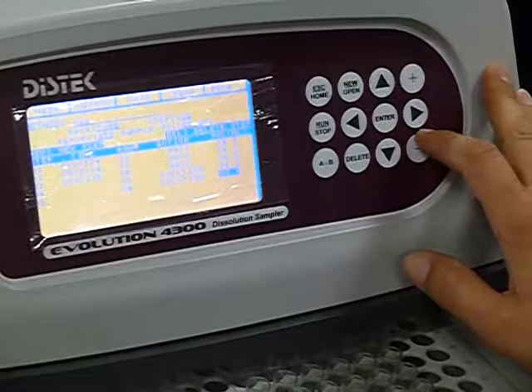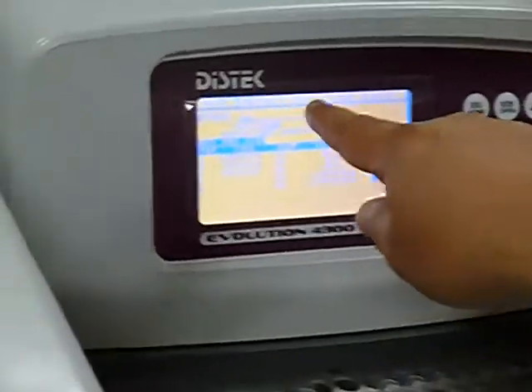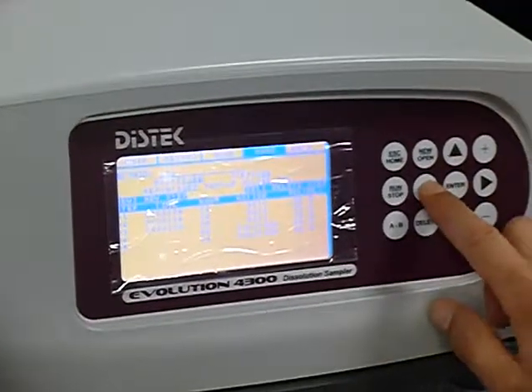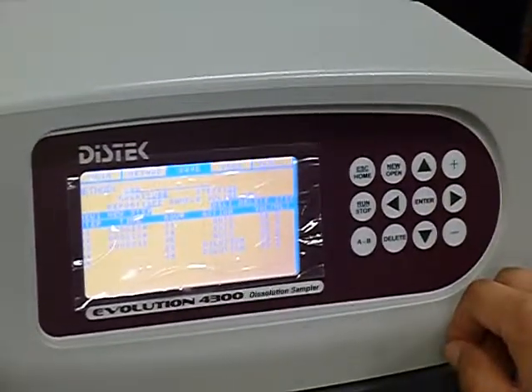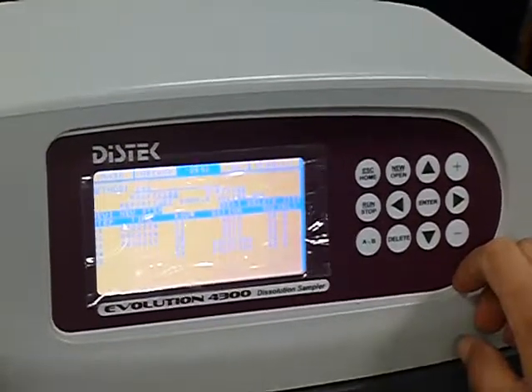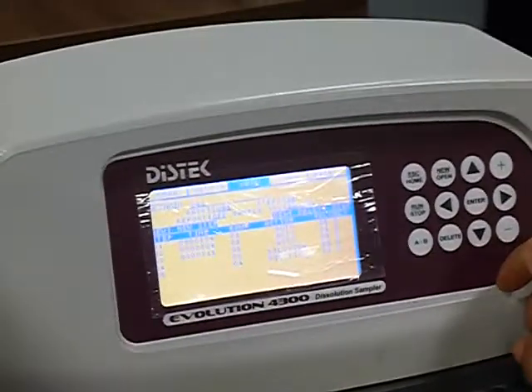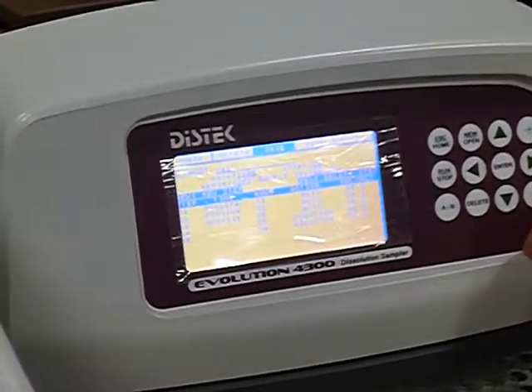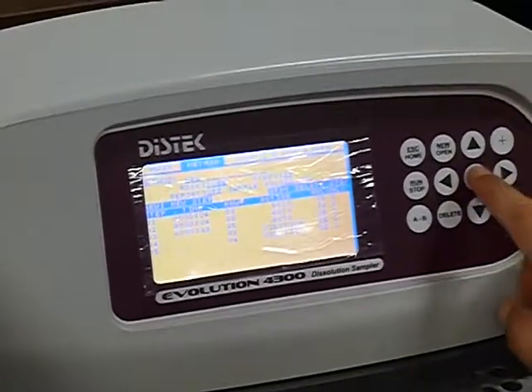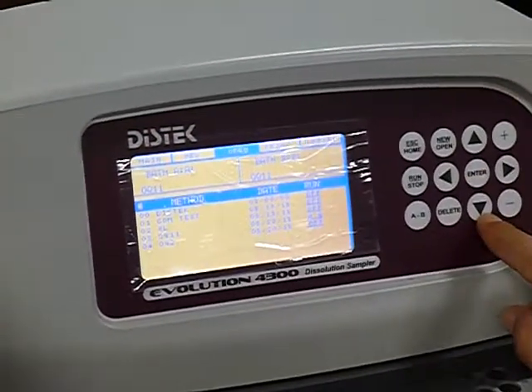Save. Where is save? Over here. Oh, you've got to go up to the... That's stupid. It's all old-fashioned system. Really, for like 30 years ago, it would be nice, but for now, it's too complicated. I don't know how people can use that. So we just method OQ2.